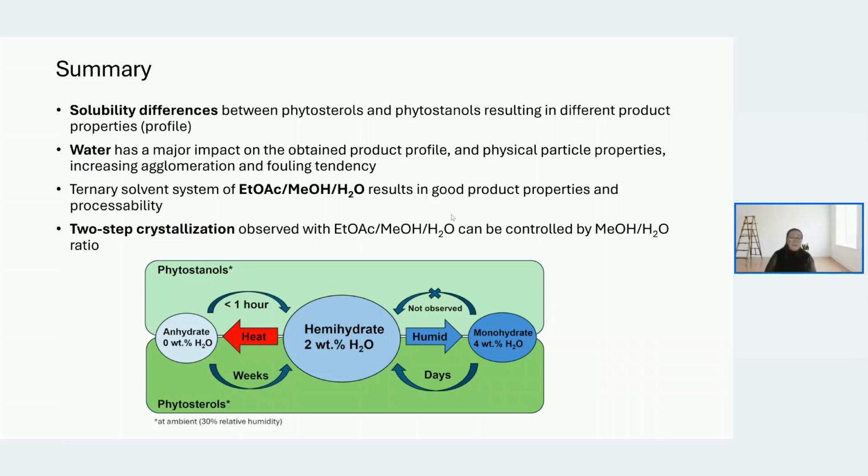Hydrate formation differences between sterols and stanols. So yeah, clearly stanols are absorbing moisture much more easily compared to phytosterols. So there were clear differences in behavior, although the structural differences are quite minor after all.